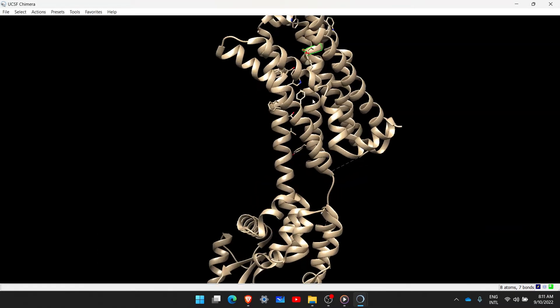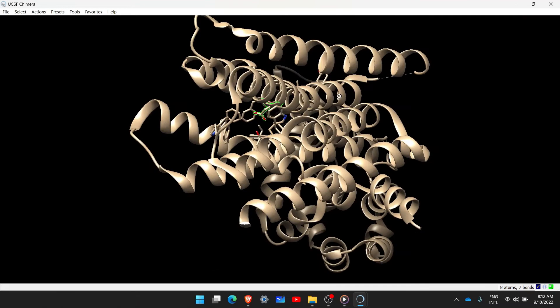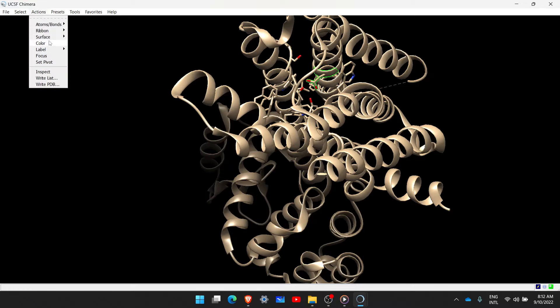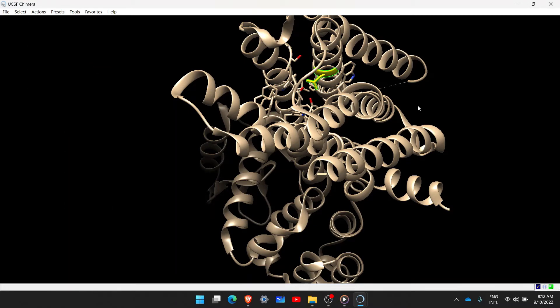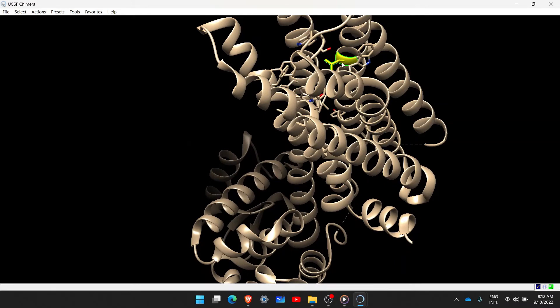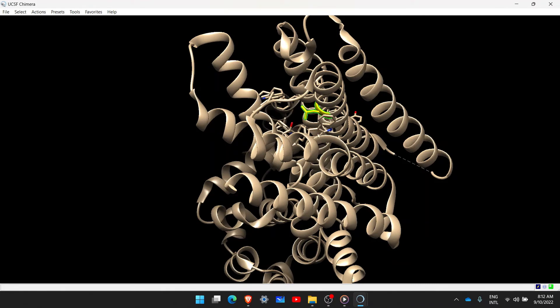I minimized the sequence window and zoomed in a little so you can see what is happening. Since I have selected this single amino acid, I will change its color so you can easily identify it. Going to Actions > Color, I set it to yellow. Whenever you see this yellow color, we are working with aspartate at position 114, which is a crucial amino acid for the activity of this protein. If you want to downregulate this protein, you can replace this residue with an unwanted or non-identical amino acid.